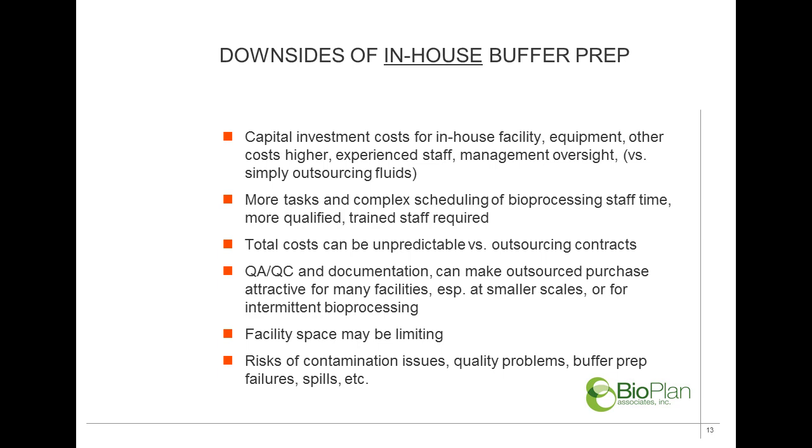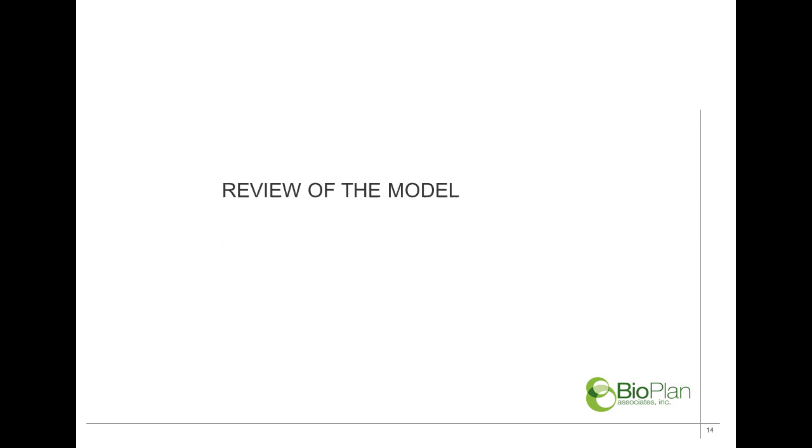Another downside is that the quality documentation can make outsourced purchase potentially more attractive for many facilities, especially those at smaller scales or those that do intermittent production. Facility space in some situations, in some regions, is very limited, and being able to manage that flex capacity can free up classified space so it can be used for more potentially beneficial operational purposes. And of course, you get to avoid the risk of contaminations associated with in-house buffer prep.